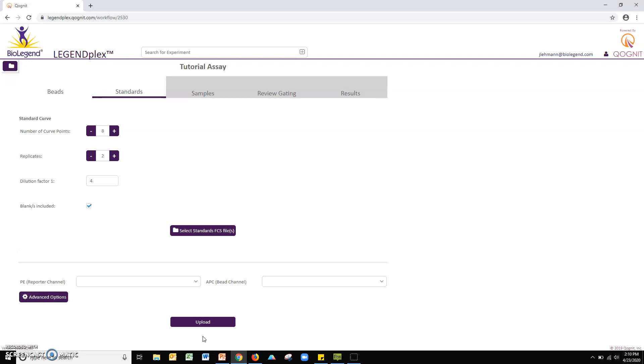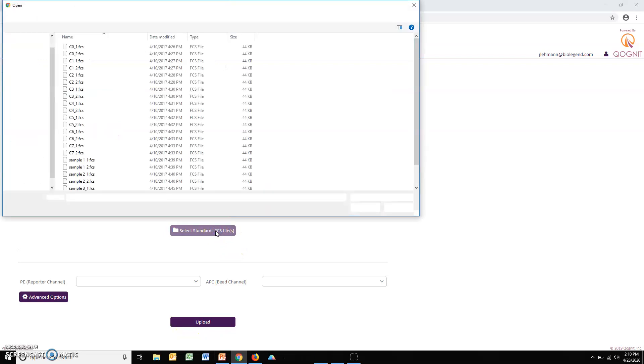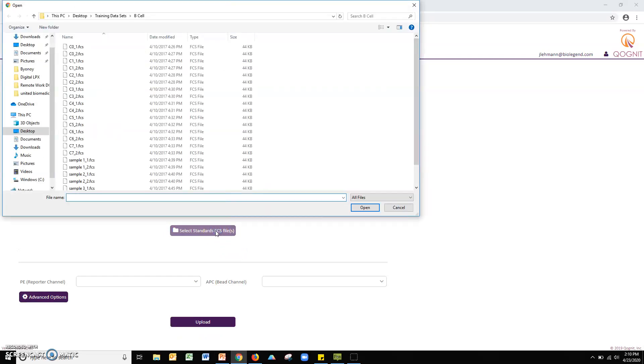Click the select standards FCS files button. Navigate to the appropriate folder on your computer and then select all standard curve files from your assay and click open.